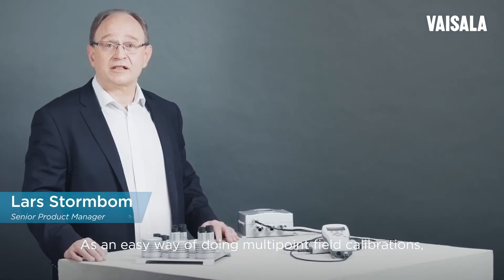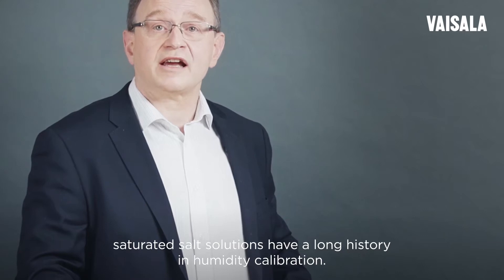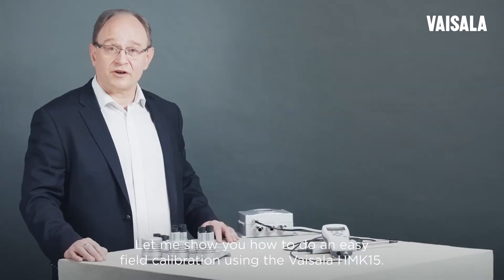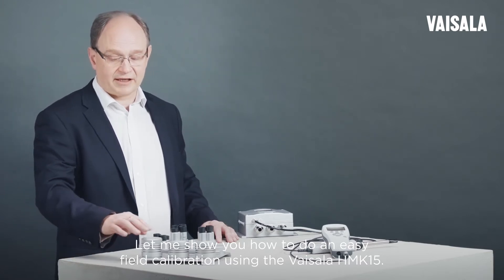As an easy way of doing multipoint field calibrations, saturated salt solutions have a long history in humidity calibration. Let me show you how to do an easy field calibration using the Vaisala HMK15.